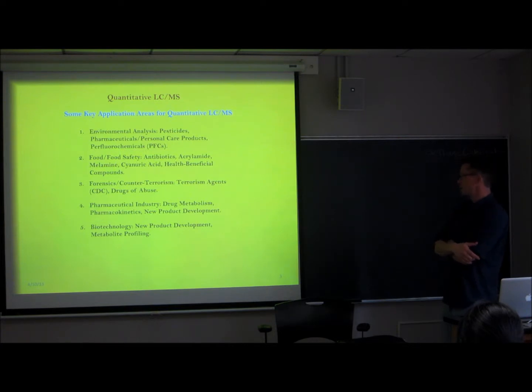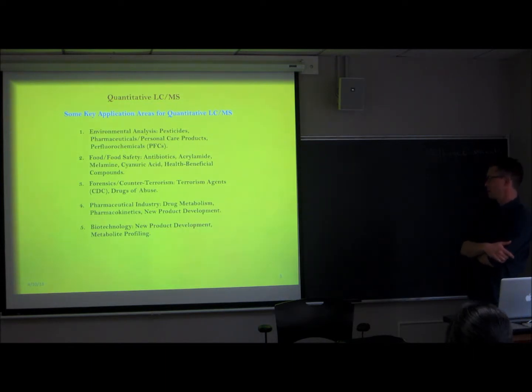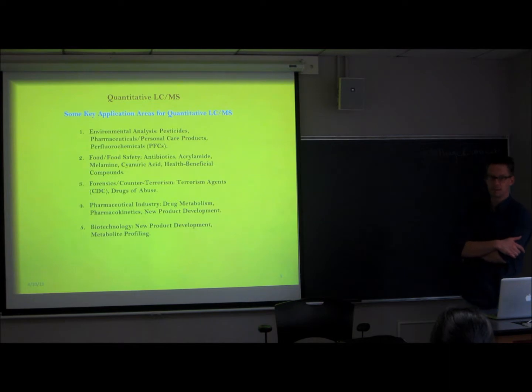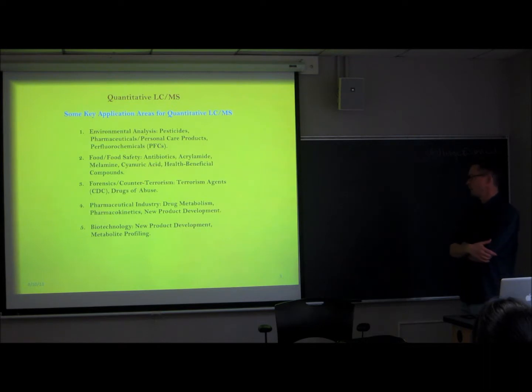Forensics, counterterrorism, looking at terrorism agents, drugs of abuse in a variety of matrices is going to rely on both GCMS and LCMS. The pharmaceutical industry, if you go to a place like Pfizer or Eli Lilly, they have warehouse-sized buildings filled with LCMS instrumentation, going 24 hours a day, looking at drug metabolism, pharmacokinetics, and using them for new product development applications as well.